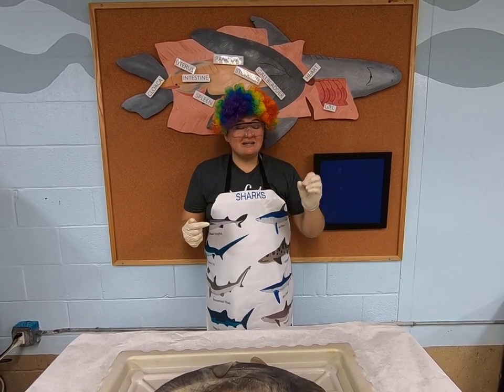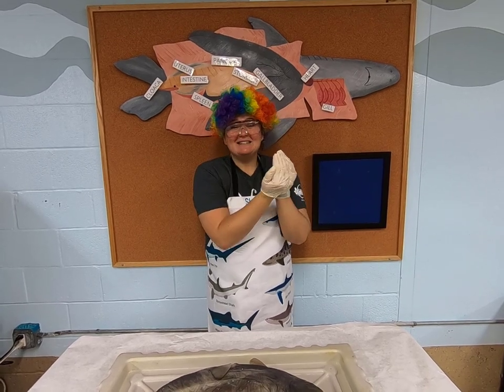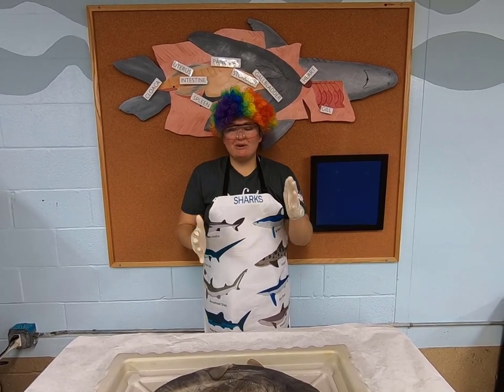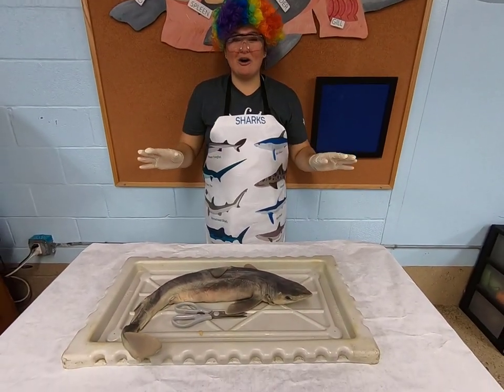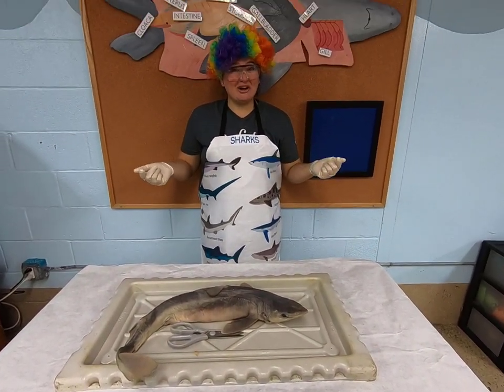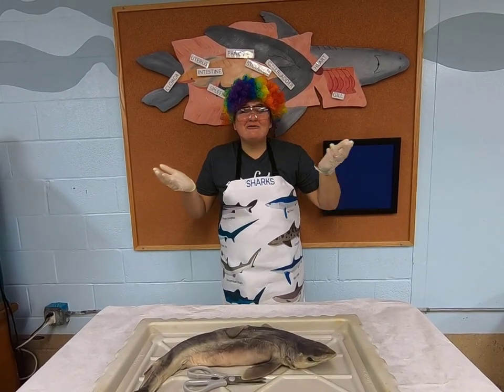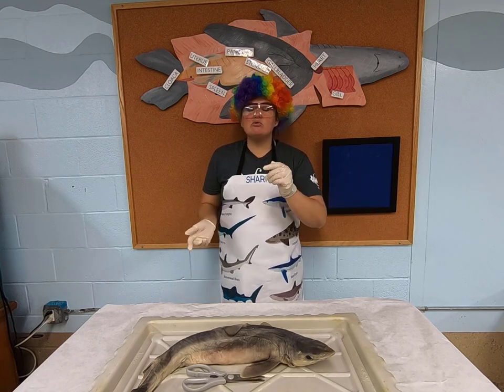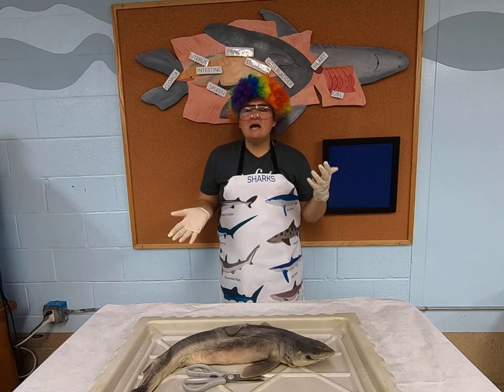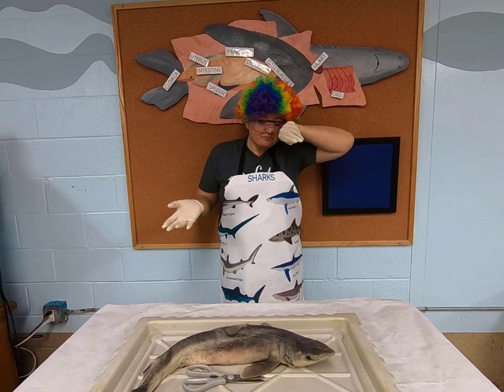Now, their lens is circular. Our lens is like a bowl. And so we can see perfectly through air, but it's blurry through water. It's the opposite for sharks. They can see perfectly through water, but in air, it would be kind of blurry. So they would need opposite goggles. They would need goggles filled with water for them to be able to see perfectly through air, which is kind of cool to think about. So they have great vision, but sometimes the water gets a little murky and they need to be able to adapt to that.